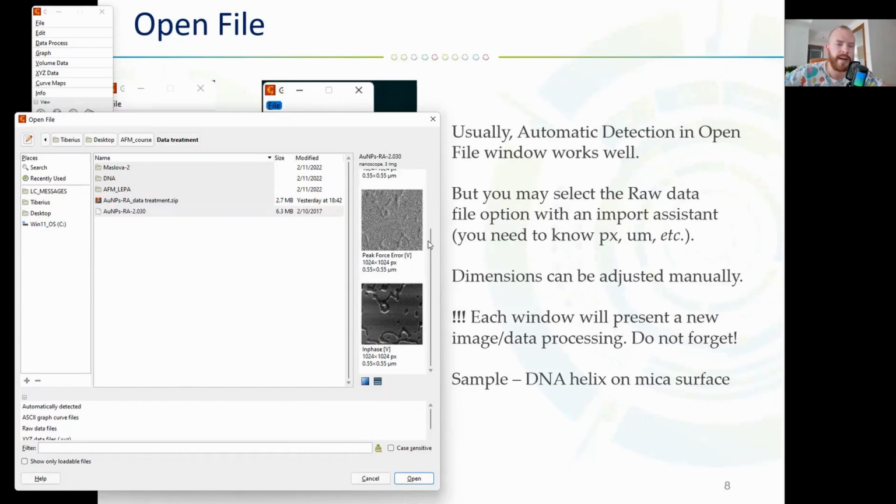Actually, sometimes error, even there is a whole science itself based on errors in AFM, because it can give you a lot of information if you know how to treat it properly, on the interfaces, or boundaries, between different phases, between different materials, and so on.